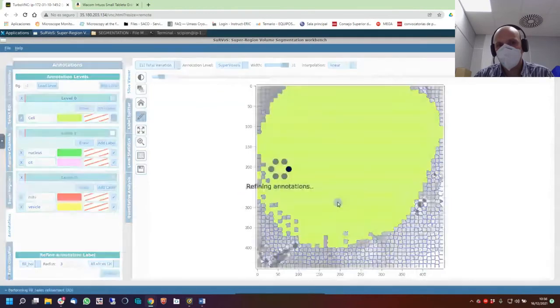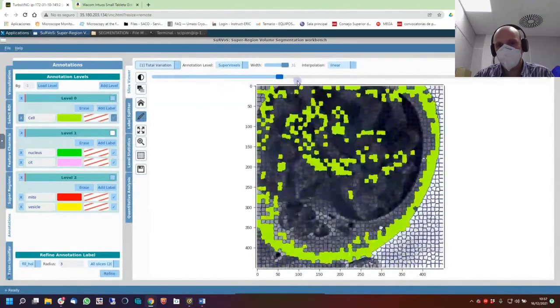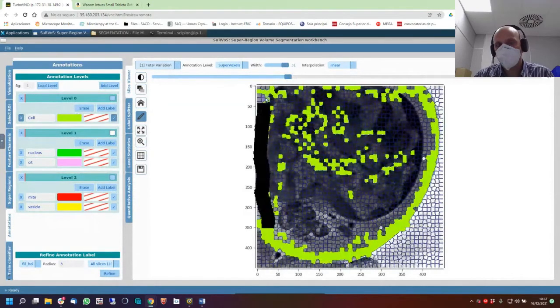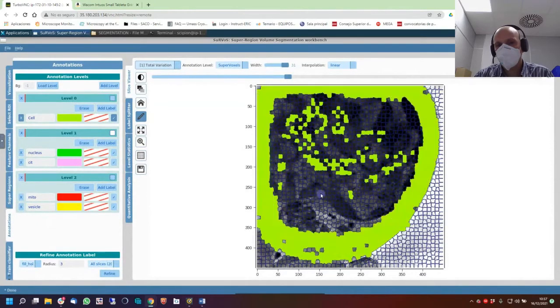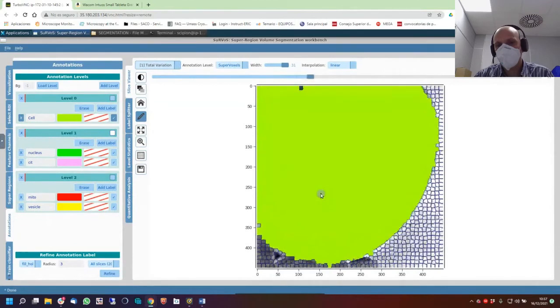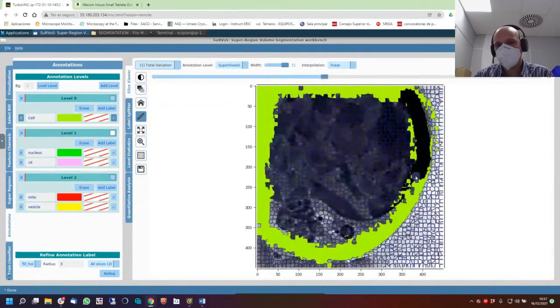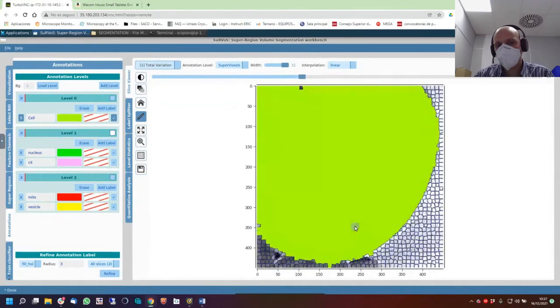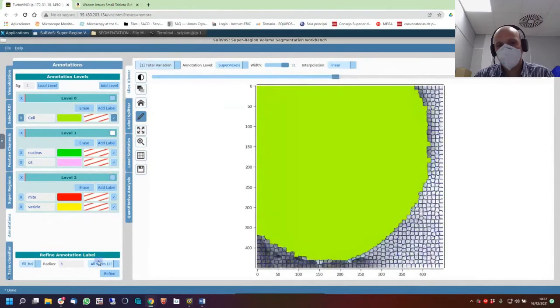Now go and see, again, it should be something open. Again, another one open. Close it. Okay. Fine.